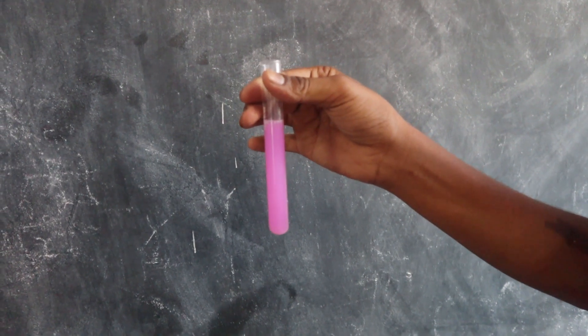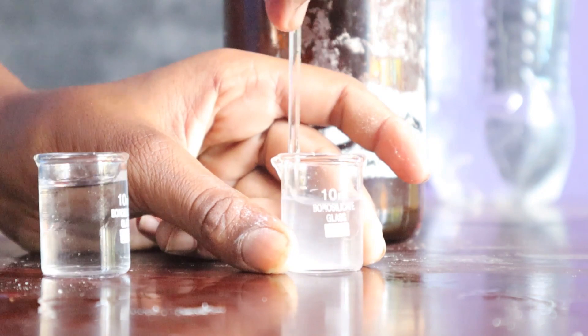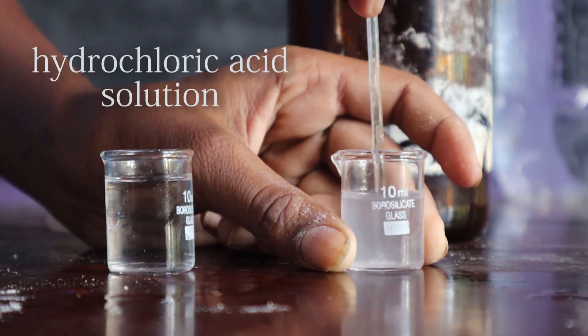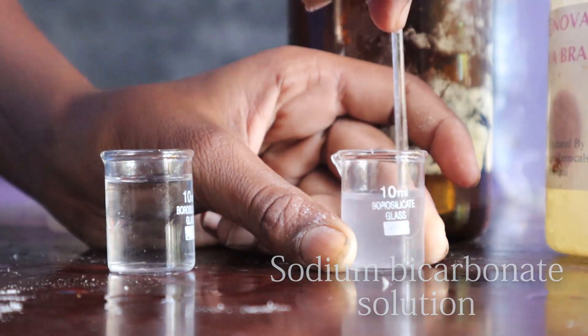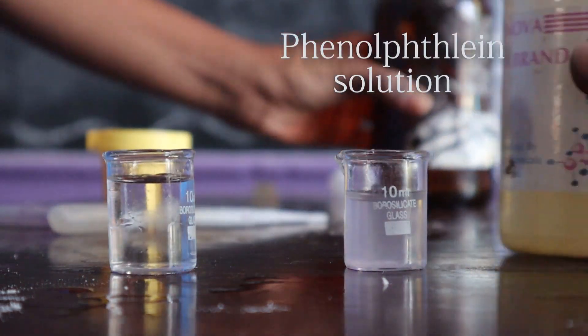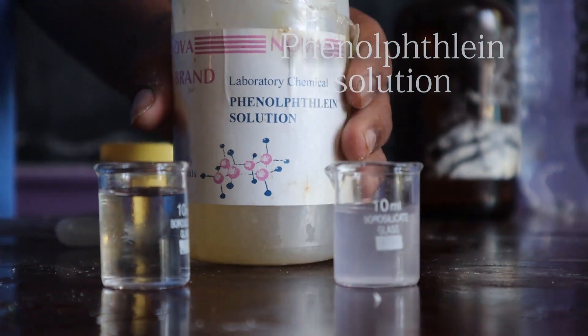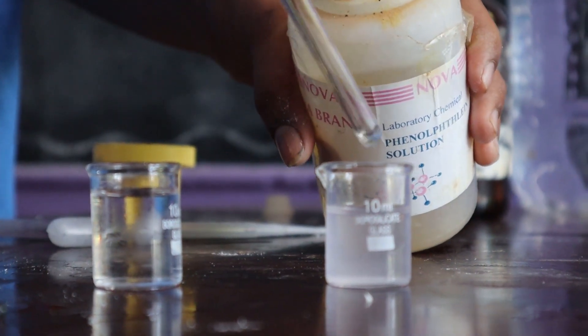This reaction looks beautiful when we conduct it with the help of beakers. This is the acid solution, meaning hydrochloric acid solution. This is the alkaline solution, meaning sodium bicarbonate solution. Now phenolphthalein is added to both beakers. The acid shows no color change, whereas the base solution turns pink.